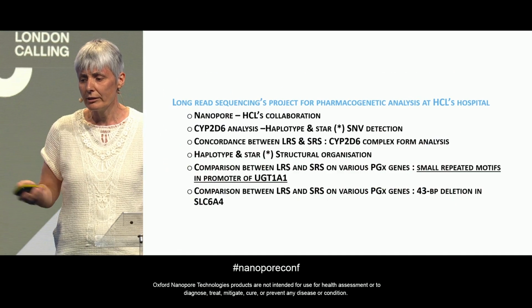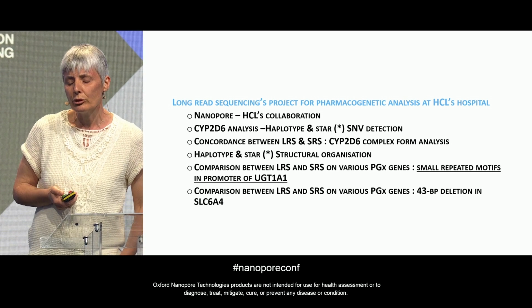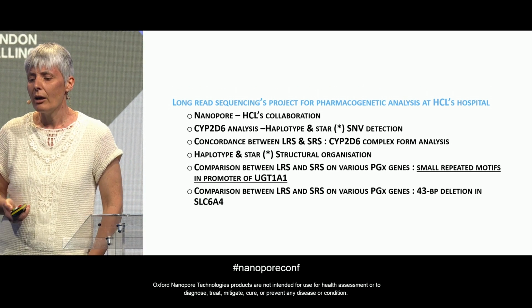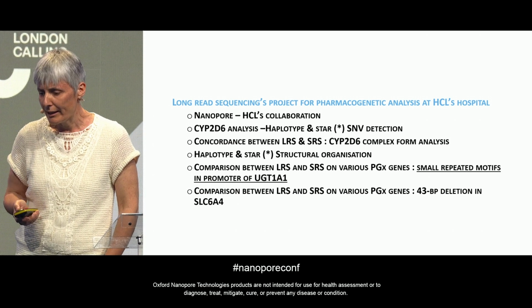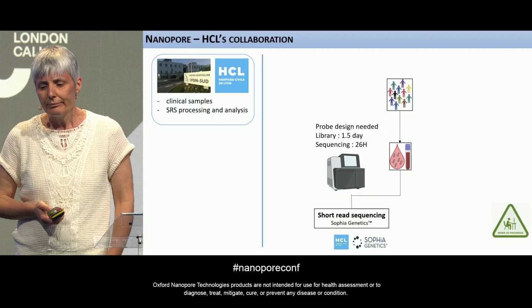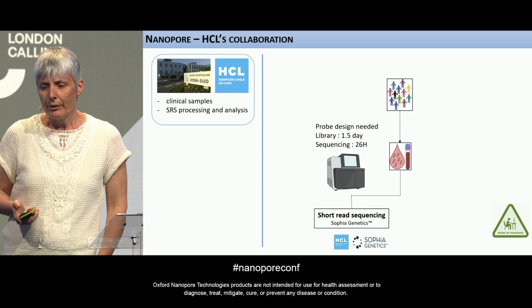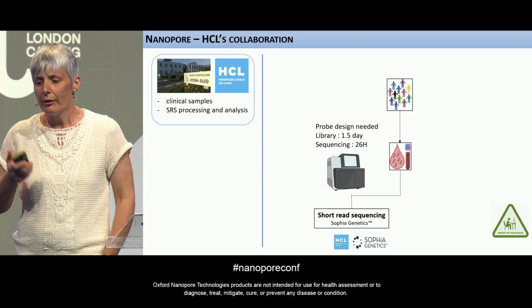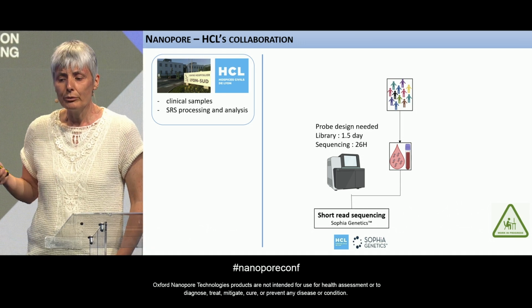So now, in the last part of my talk, I'm going to talk about our experience with long-read sequencing for pharmacogenetics analysis. So, we selected 26 samples representative of the genetic variation of CYP2D6 in our routine.